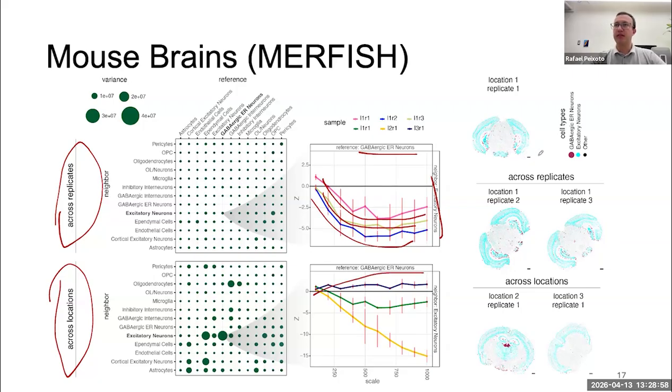And we visualize this in space and notice that there are different patterns. So depending on the location that you get, for example, for this location here, you can see a very central pattern. For this location here, you can see the GABAergic neurons are more dispersed in the central side of the tissue. So this is good to show that CRAWDAD works for comparing samples.